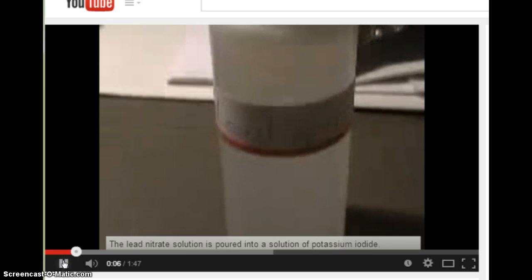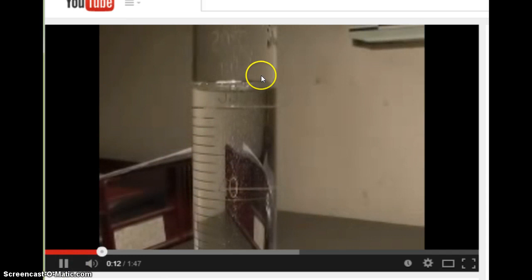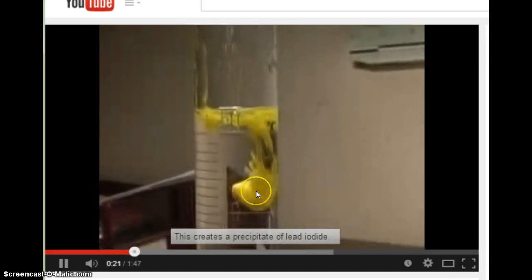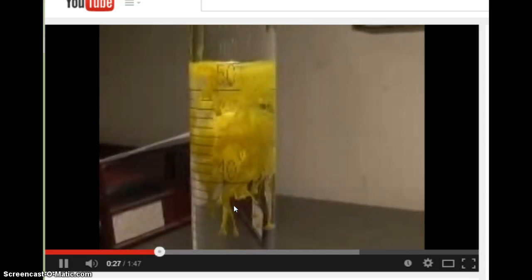And so we have two clear liquids. We have lead nitrate, and it's poured into potassium iodide. You can see they already have the clear liquid in here, and they're adding a little bit more of the clear liquid. The other clear liquid, the lead nitrate, was clear, and then boom! As soon as those two clear liquids touched, look what happened. It made a precipitate of lead iodide.